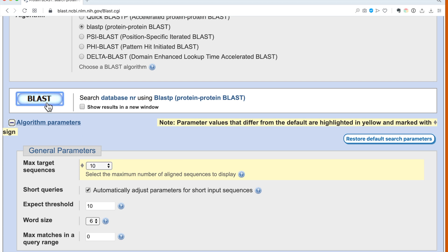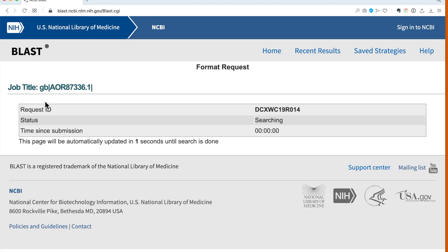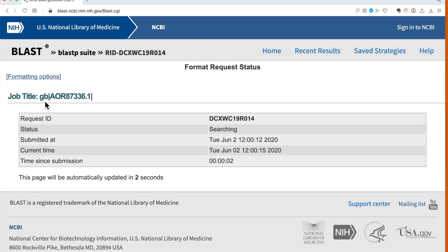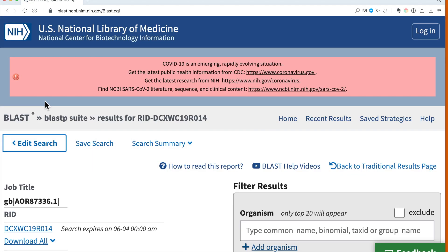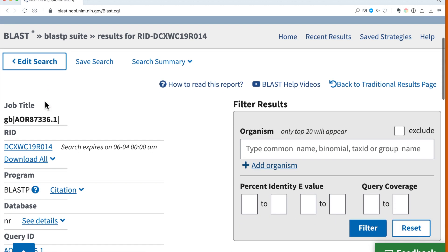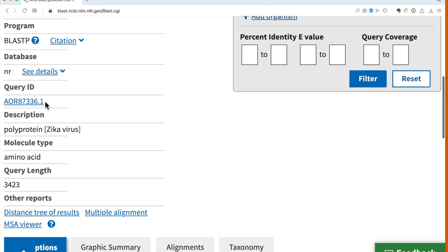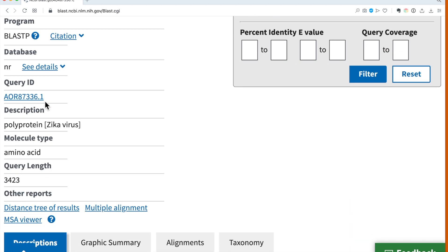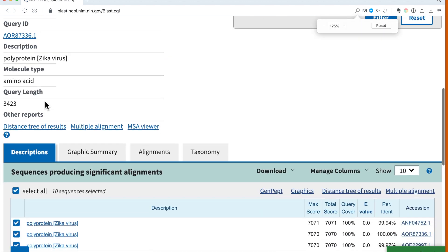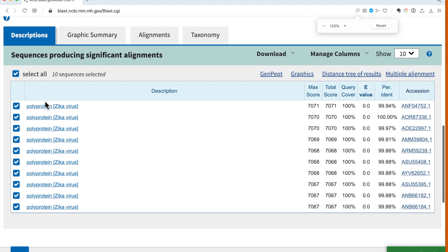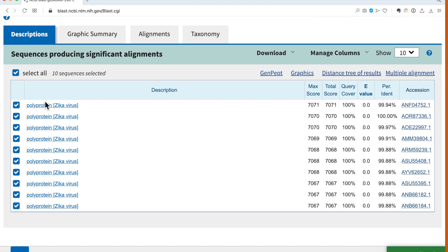So if we then go to BLAST and do the search, we'll have to wait a little bit while the update window tells us about the status of the search. Now that the search is finished, we can scroll down to the results.